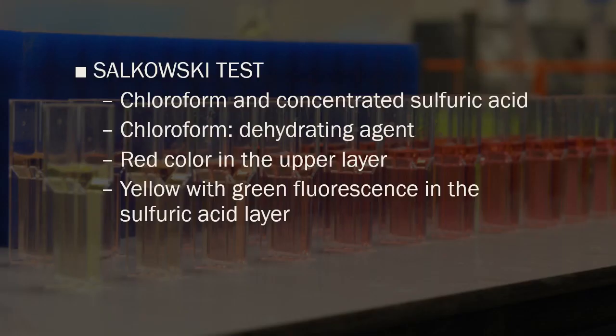Moving on, you have here your Salkowski test. This one is a test for your cholesterol.